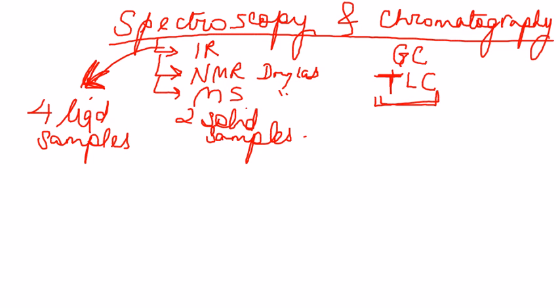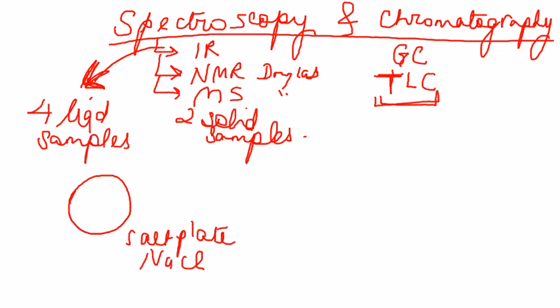And so in case of the liquid sample, all you got to do is you run it on a sodium chloride salt plate, is what it's called, salt plate. And like I said, it's made of sodium chloride. It's a special type of very pure sodium chloride. Please do not put water on that, because obviously it's going to dissolve. So when you come over there at the station, you will cleanse the salt plates.